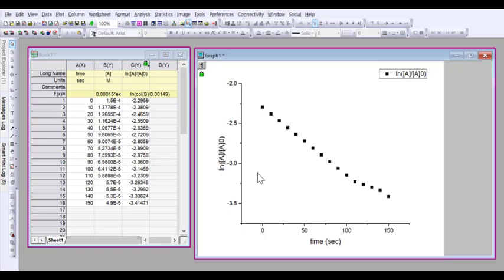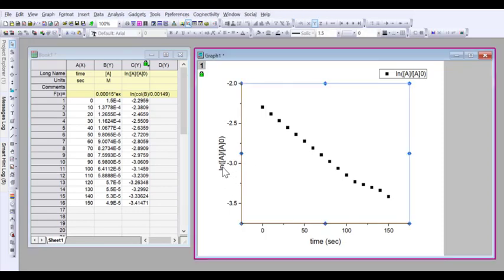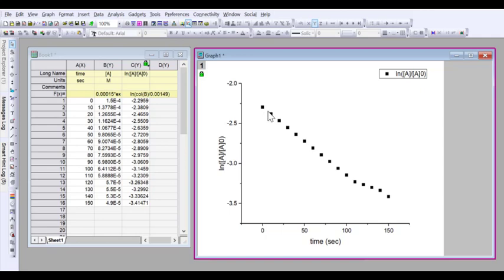So what we have here is a plot of log of concentrations against time, and normally what we want to do is get the slope of this line so that we can calculate the rate constant.